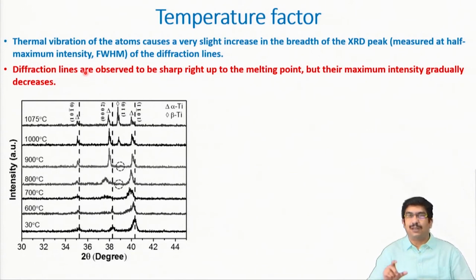First of all, the thermal vibration changes the interplanar spacing in a unit cell just because of this atomic vibration. The unit cell expands, and as an effect the peaks can shift on the 2 theta axis. As we will understand when we discuss diffraction of real specimens, this change in 2 theta means the peak width should increase in the overall process.